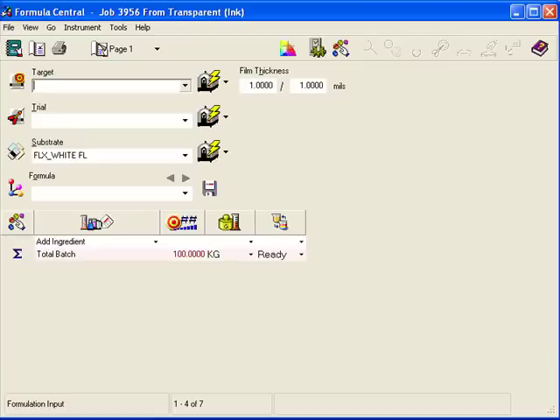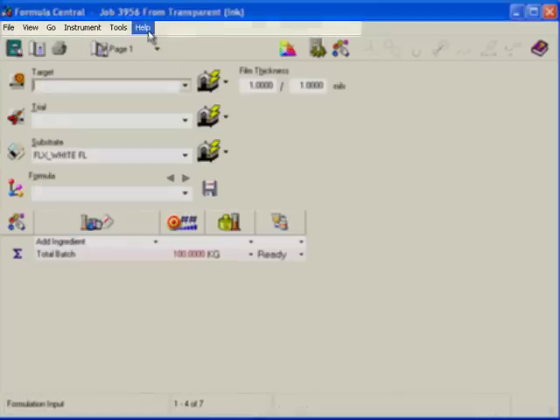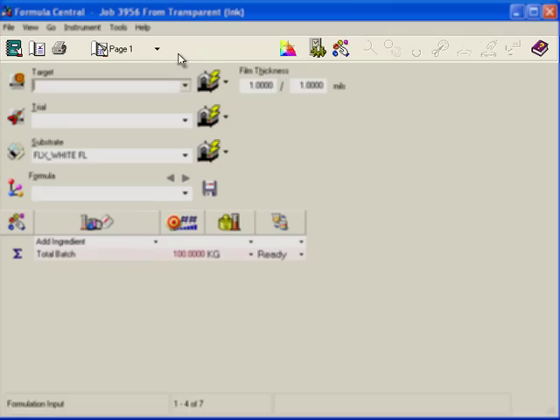This is Formula Central. Like most Windows, there's a menu, a toolbar, and a status bar.